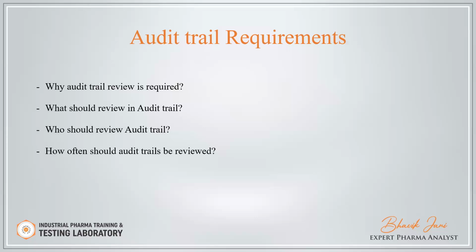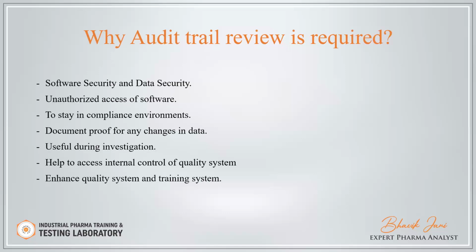Now we will discuss the audit trail requirement. Why is audit trail review required? What should be reviewed in the audit trail? Who should review the audit trail? How often should the audit trail be reviewed? So, why is audit trail review required?